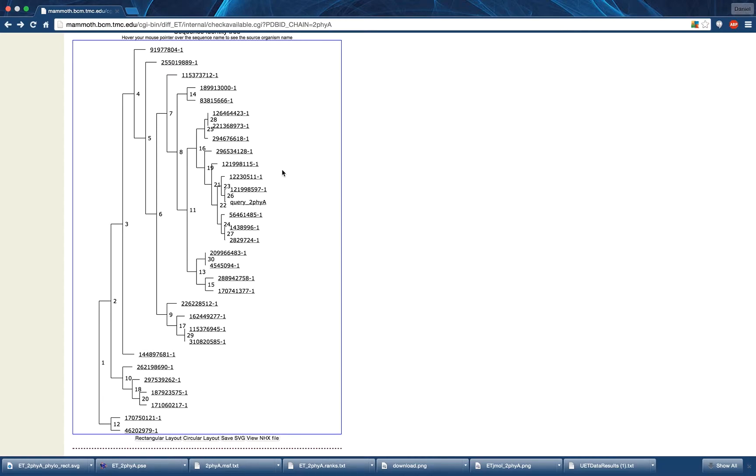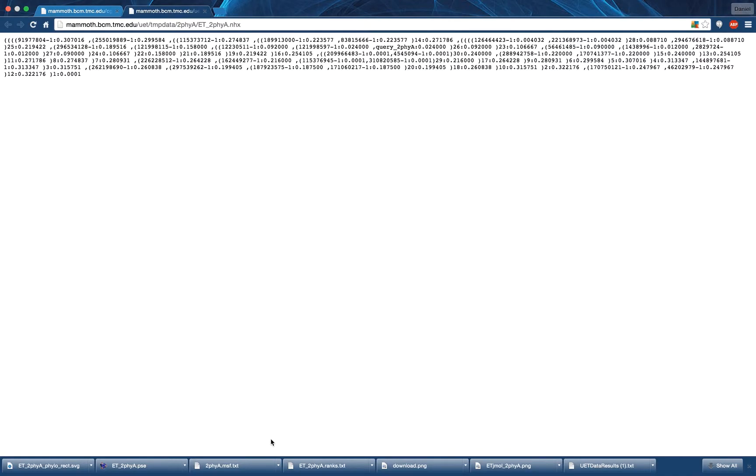The NHX file representing the tree can also be downloaded by pressing the View NHX file and then right-clicking and selecting Save As.